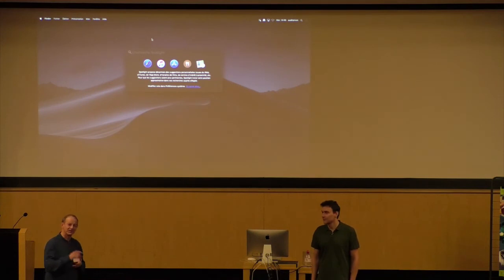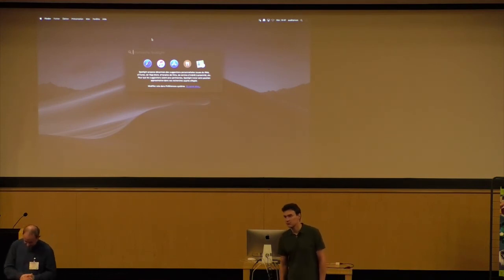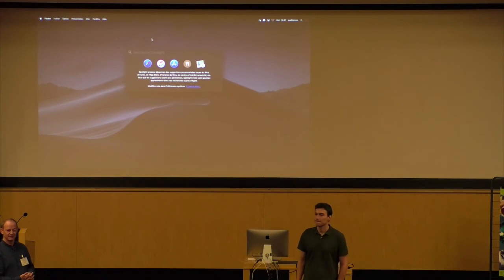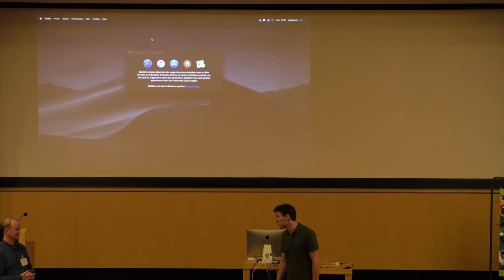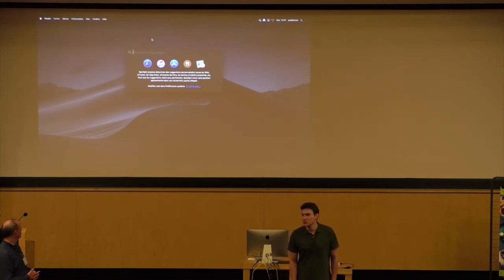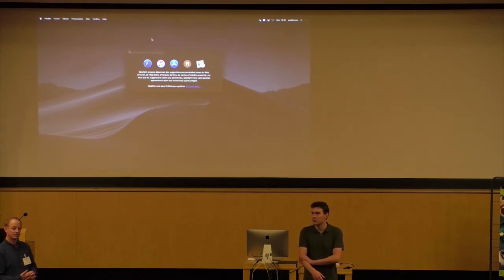This is a two-part question. Let's assume you have a sample and you want to make several grids. How long does it take per grid? And the second question: assuming you have several users with different samples, how long does it take to wash the device in between and start all over again? If the whole setup is set up, it takes me just 2-3 minutes per grid. To set up all positions and prepare the ethane takes half an hour for sure. But if everything is set up and you saved your positions, then it's 2-3 minutes per grid.